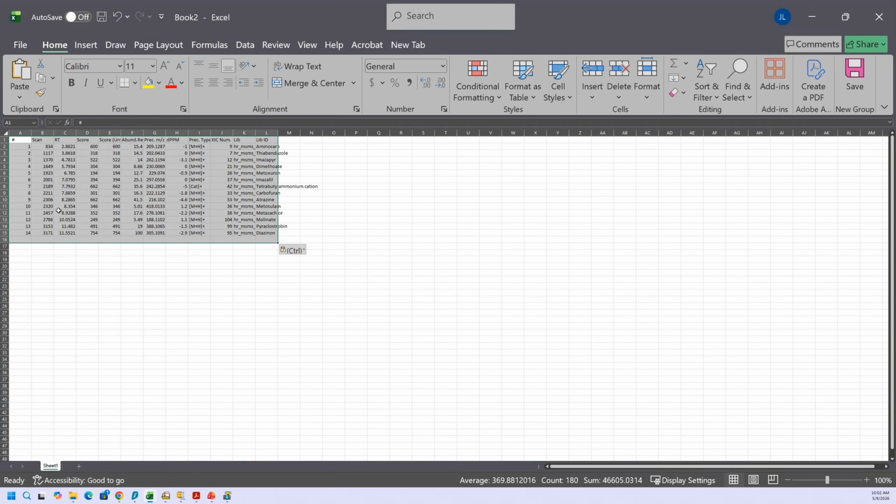And now we have a report that I could either retain for later use or actually send to a customer if I wanted to. So that's pretty much how you do the majority of the work within the software to select what you want and get it in a report format after you do the review.